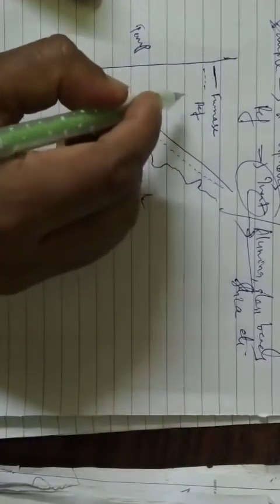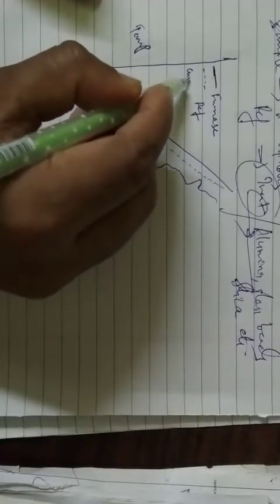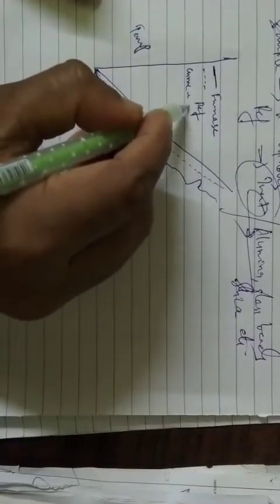If you see the XY recorder here, this is time versus temperature. Now this thick line represents the furnace, the dotted line is the reference, and this final curved line is that of the sample.